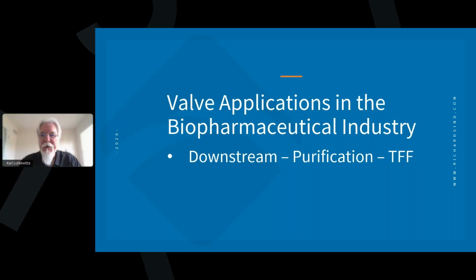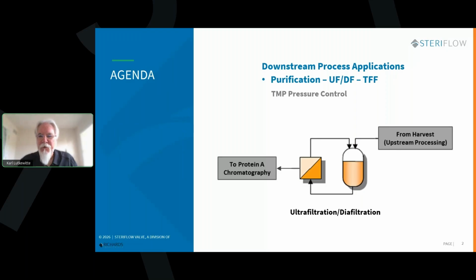So today we're going to talk about downstream purification, TFF applications, and specifically we're going to talk about TMP, transmembrane pressure control, and UFDF, ultrafiltration, diafiltration, TFF installations.